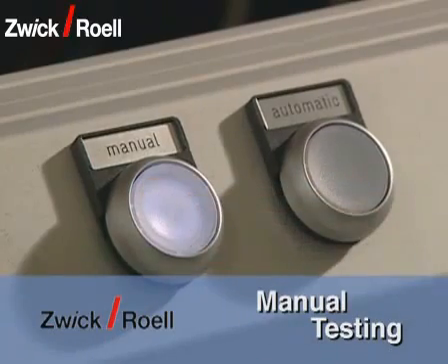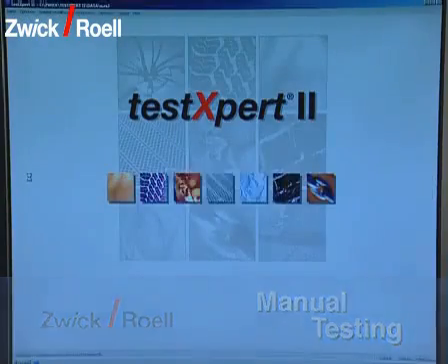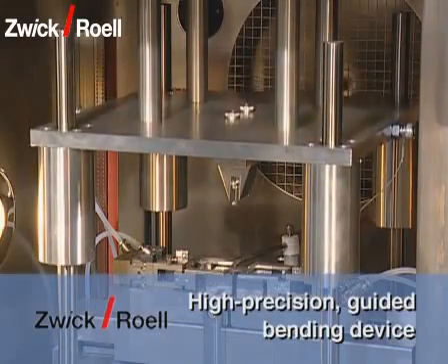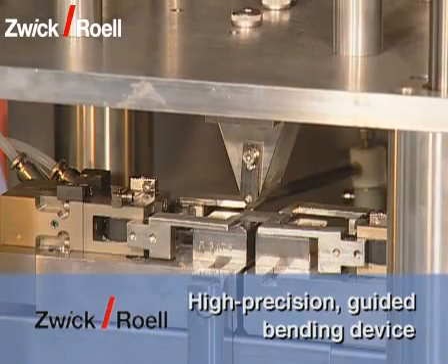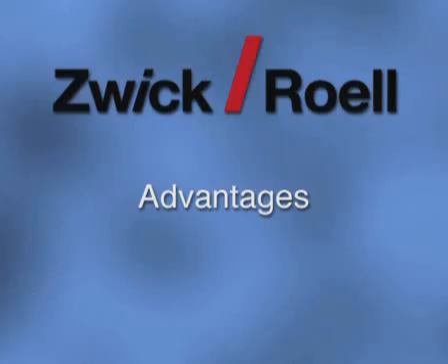With the test system, manual testing is possible at any time. There is no need for retraining, as for both manual as well as automatic operation, the test expert software is used. The bending device is equipped with an additional high precision pillar guide. This guarantees the most extreme parallelism of the test arrangement and an axial load transmission.